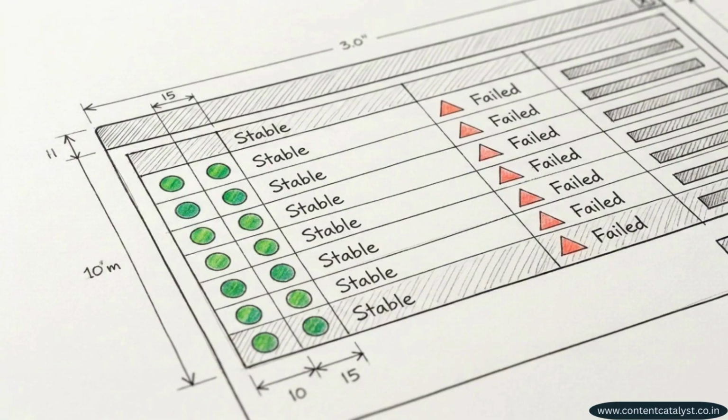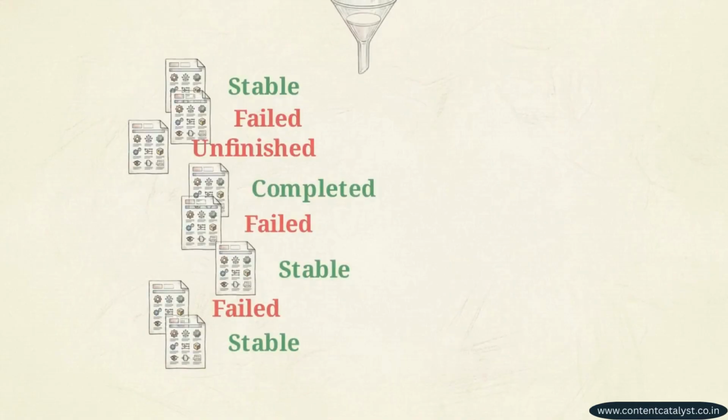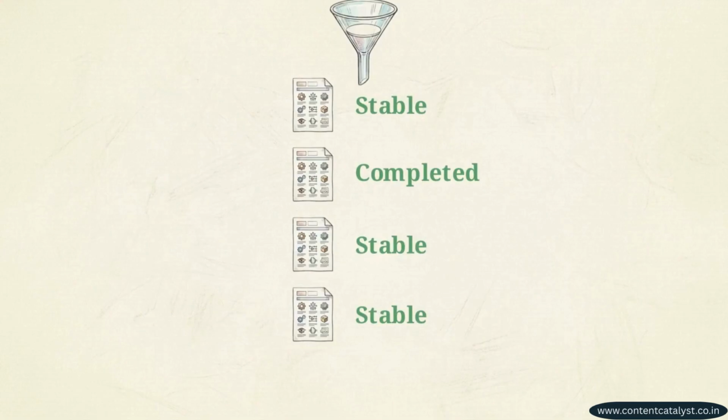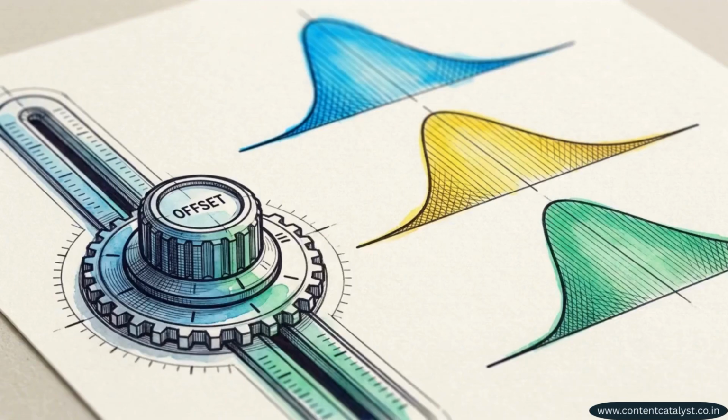Profex addresses this lab disorganization directly with a refined project selection dialog featuring built-in status indicators. These visual filters allow a researcher to instantly locate a stable, completed refinement and quarantine failed or unfinished tests, maintaining a clean chain of evidence.